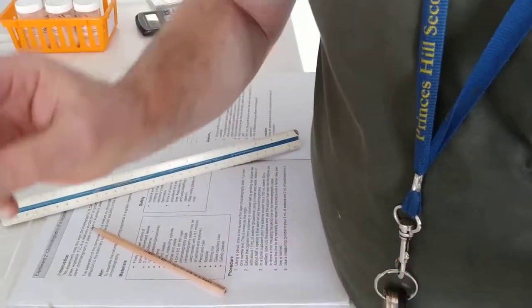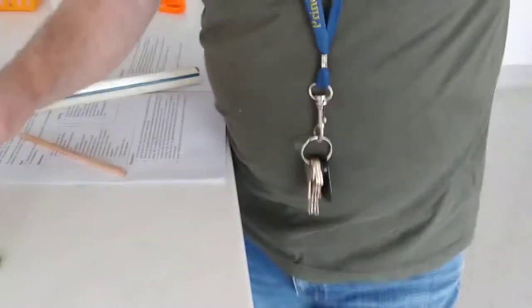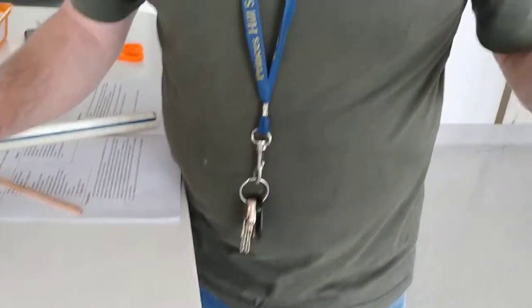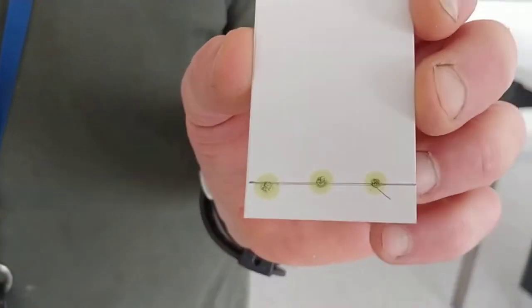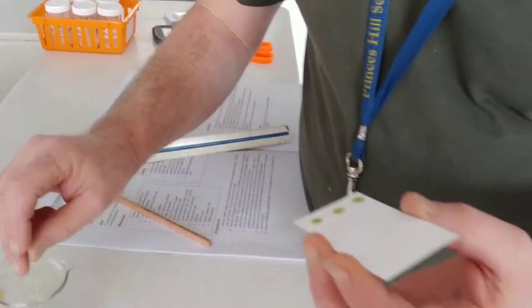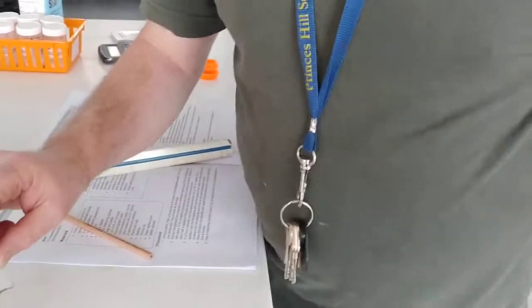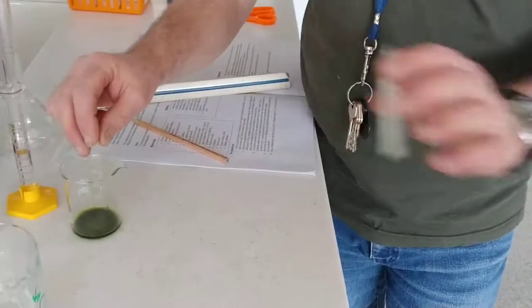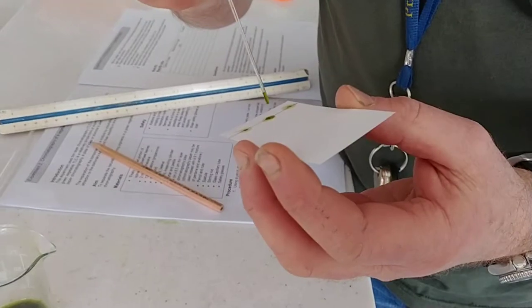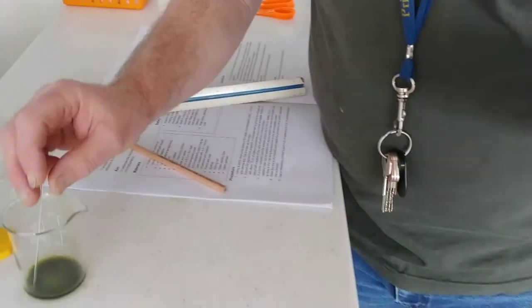Now, because we're using acetone, it's going to dry real quick, so we just air dry it. It would be nice if these drops were smaller, but we can't get them any smaller than that. So we'll do it again 3 times. Give it a nice dry. And that's our 3 drops.